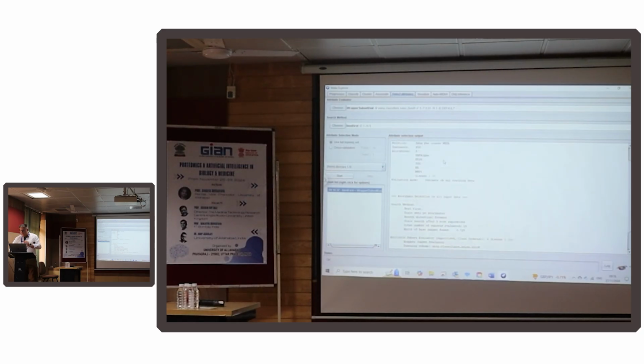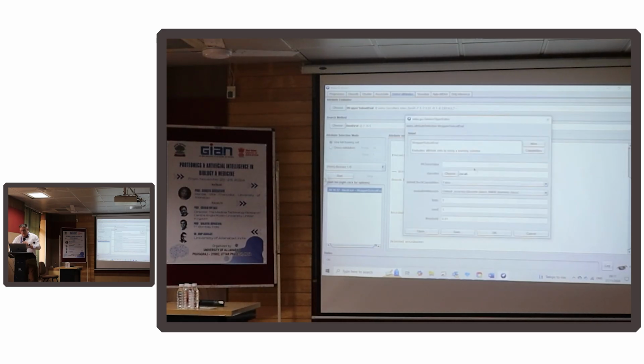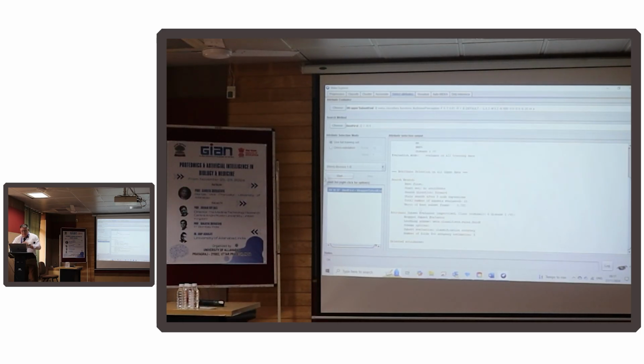So for a random forest, it's put 6 attributes forward, and then, okay, did it work? It didn't work for that, so I'm just going to choose a different one that I know works, which is a multi-layer perceptron. Click OK, click start.